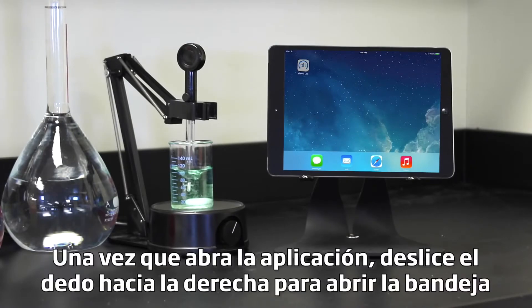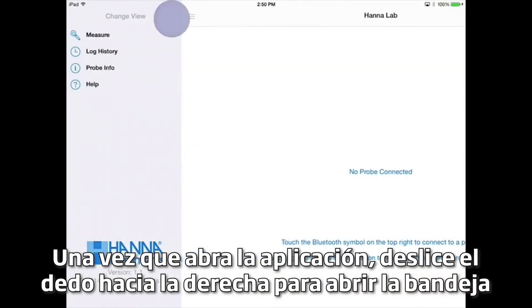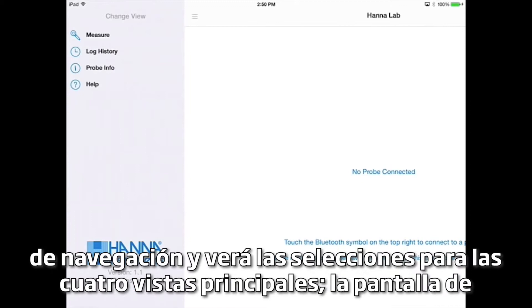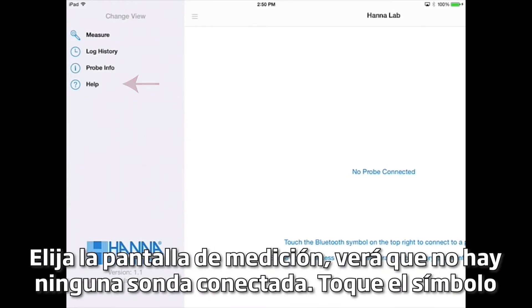Once you open the app, swipe to the right to open the navigation tray. There, you'll see selections for the four primary views: the measurement screen, the log history, probe information, and help. Choose the measurement screen.